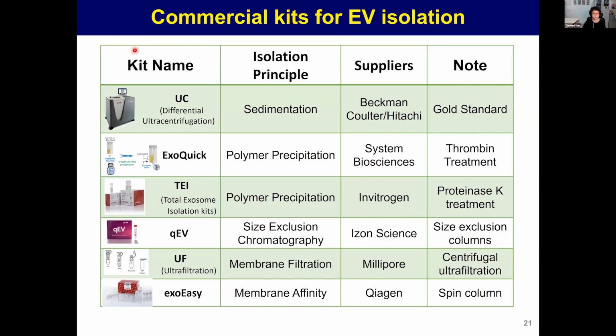These kits are listed here, and the isolation principles include ultracentrifugation sedimentation, and for the kits, polymer precipitation, size exclusion, membrane filtration, and membrane affinity.